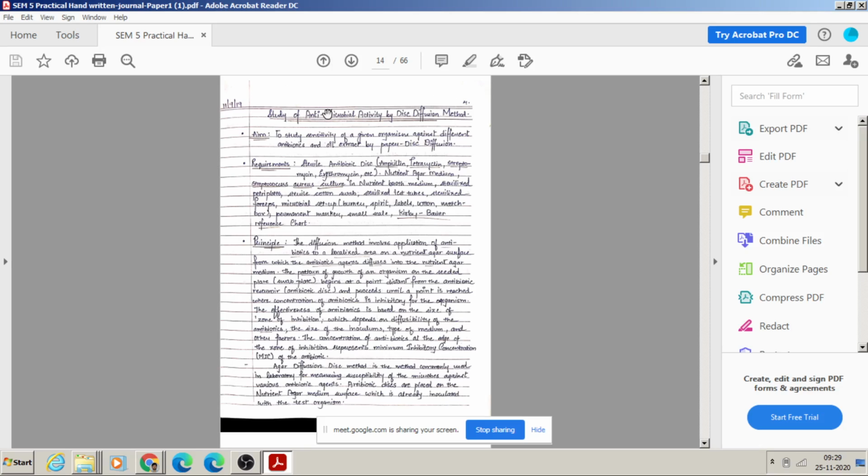So today's practical is about the study of antimicrobial compounds, and here you know that there are various chemical substances existing in nature, or natural products. They may be in a plant leaf, or in a rhizome, or in any other organ, and from that extract, generally what we do is try to prevent the activity of microorganisms which are hazardous, harmful or pathogenic in nature for plants as well as for animals.